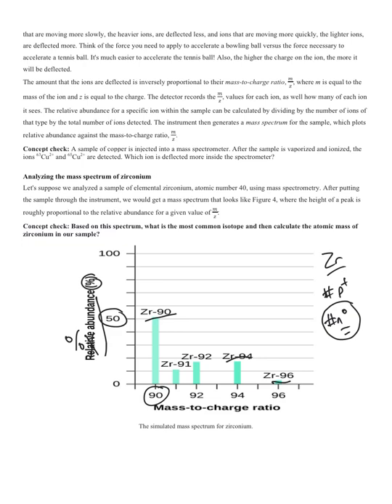So from here, we'd estimate that it's a little bit above 50, so maybe we would say this is around 51% zirconium-90. Then the next one at 91 looks like it's a little bit above 10, so maybe about 11% zirconium-91.